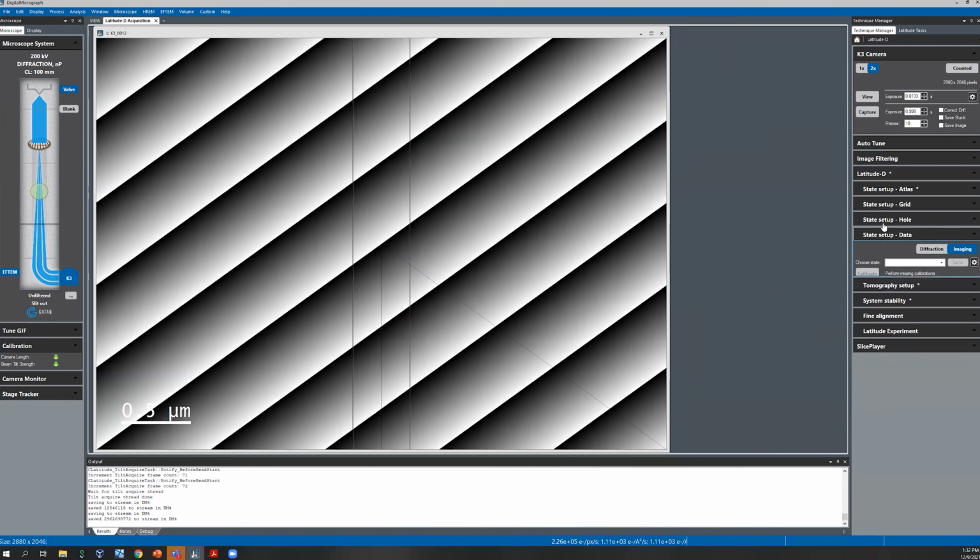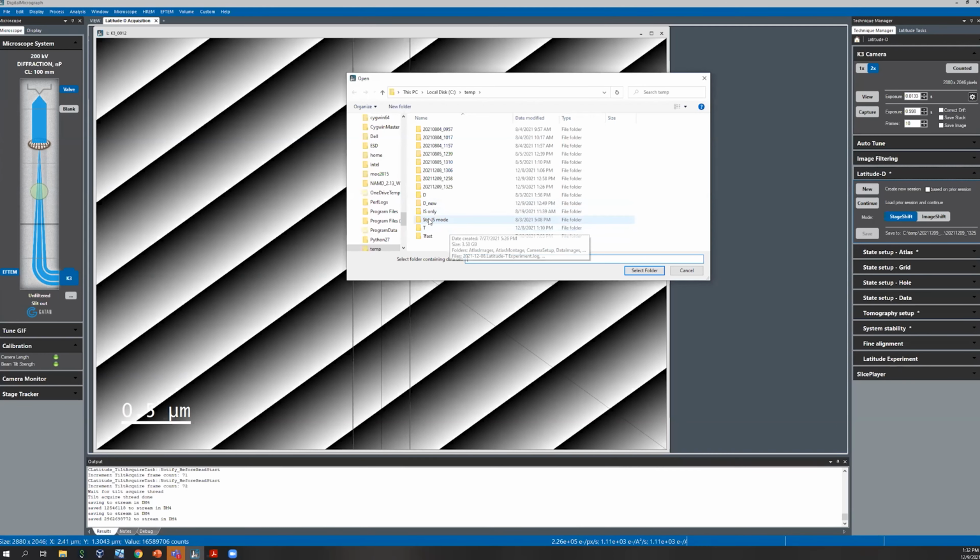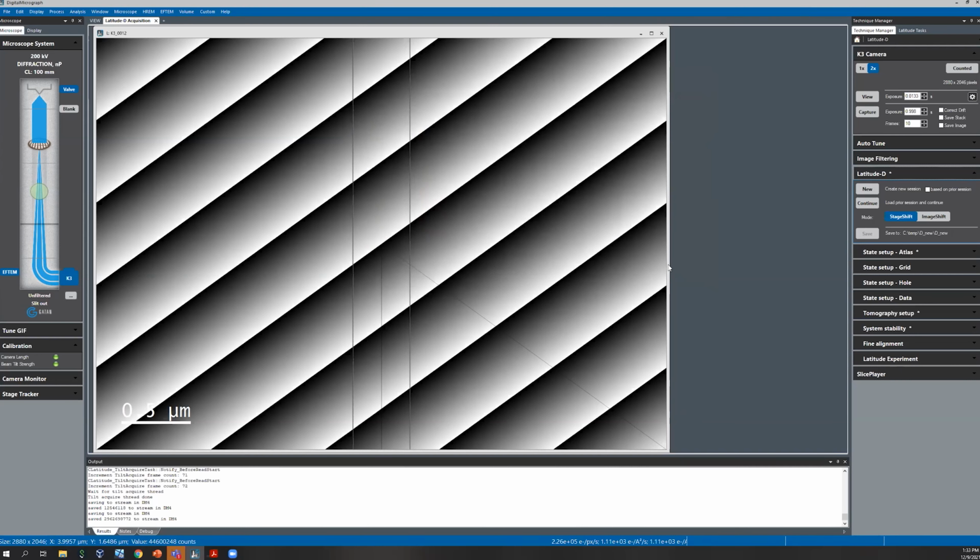Now, for the sake of ease of this demo, I have created a session for this demo in particular, where I have saved and created all these 4 states, and I'll be continuing that session. And this is one of the examples how continuing a session comes really handy in many, many cases because it saves a lot of time, especially when a mishap happens.